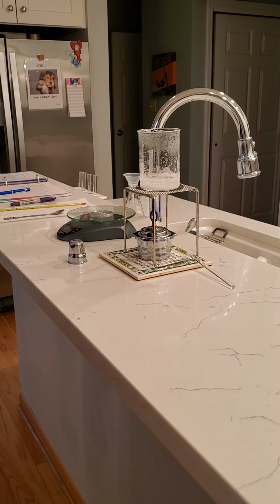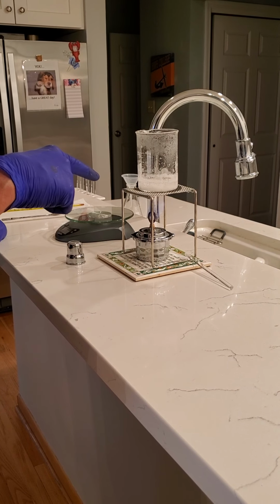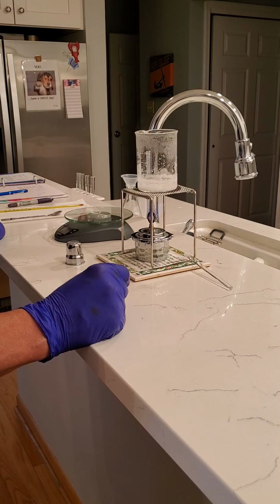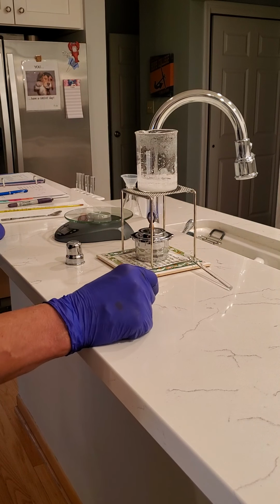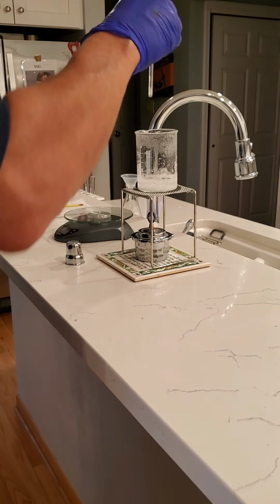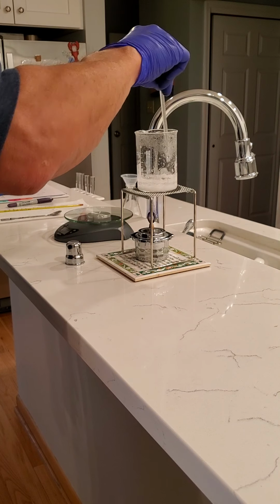Class, you can see now that we're getting close to the end. There's actually no clear water left. It's maybe about 10 mils of water left, and the salt is still remaining behind while the water is being driven off. We'll give this a couple more minutes. I just wanted you to see the water vapor coming off and how cloudy the solution is becoming as the salt remains behind. We break it up with a stirring rod every now and then just to help break up the chunks of salt, so the water can come off more easily.